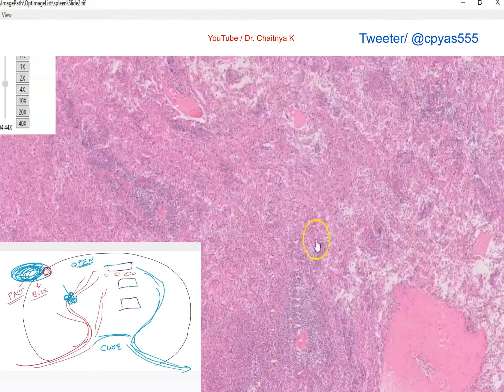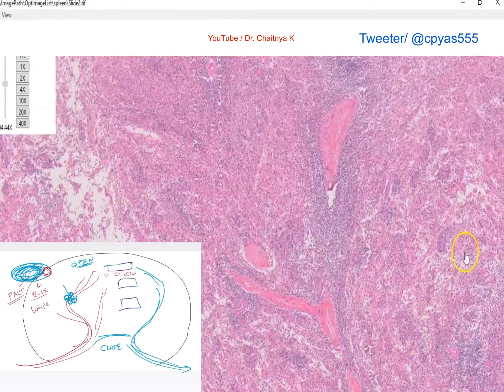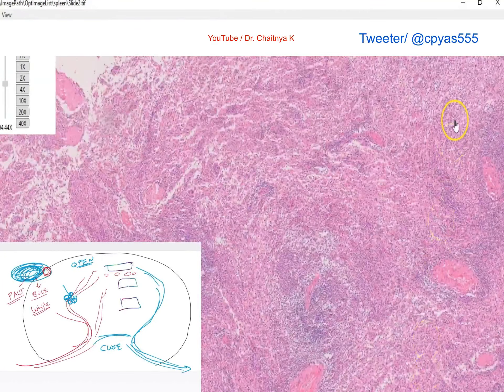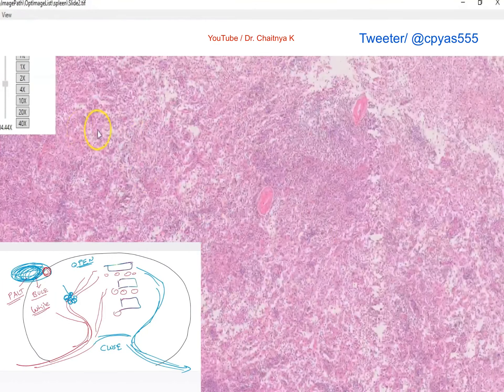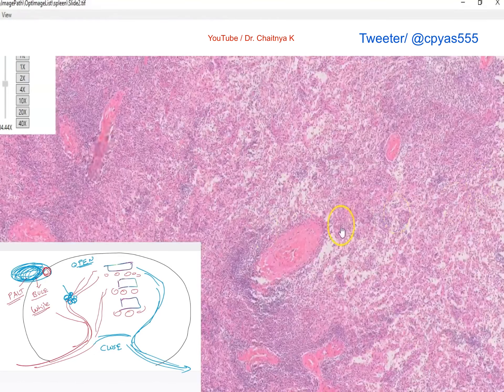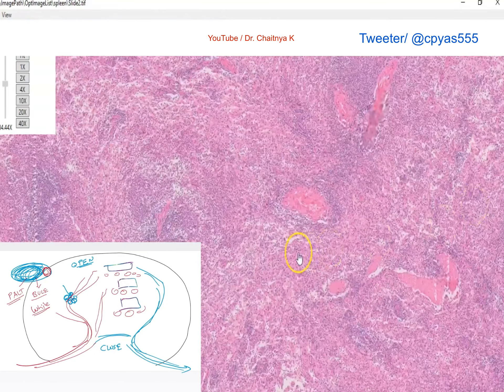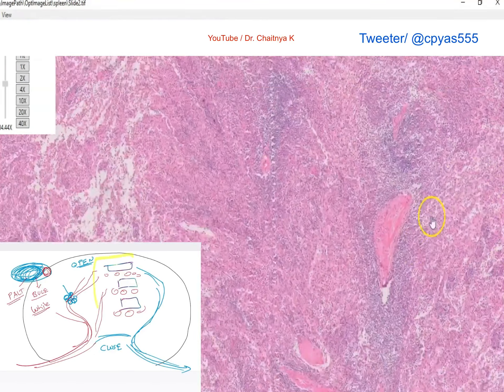The key identifying features are: hemosiderin-laden macrophages, sinusoids, white pulp in the form of lymphoid aggregates, trabeculae separating them, and macrophages in the red pulp. So this is definitely a spleen under the microscope.